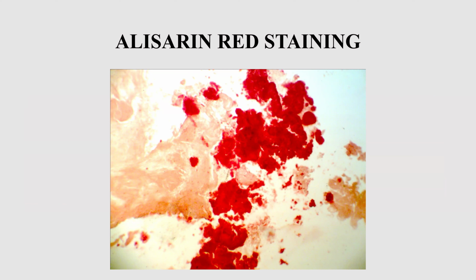A feature of this dye is that we can use it for calcium ion identification in a very narrow pH range, pH 4.0 to 4.5. We use a pH meter for working with this dye in tissues.